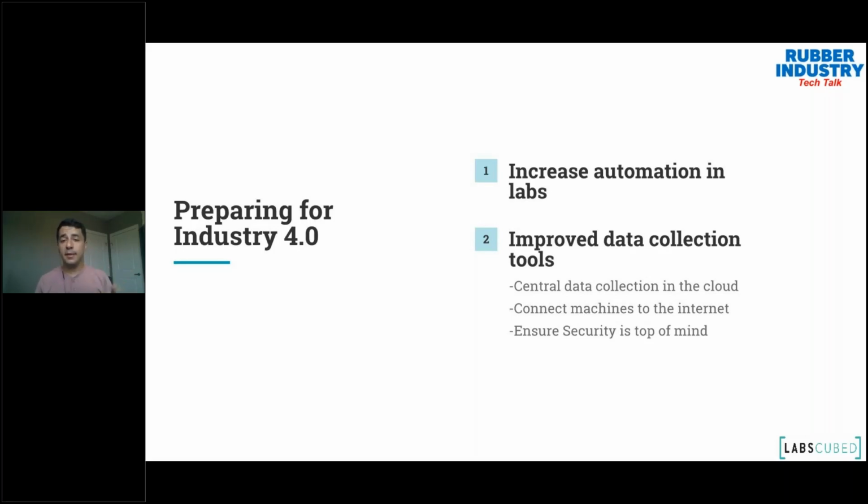And that can be anything. It doesn't have to be what we have. There's other offerings out there that might be more important to you. Maybe hardness is more important. Maybe the rheology data is more important. Whatever is important to you, look at that and see if there's potential to automate.